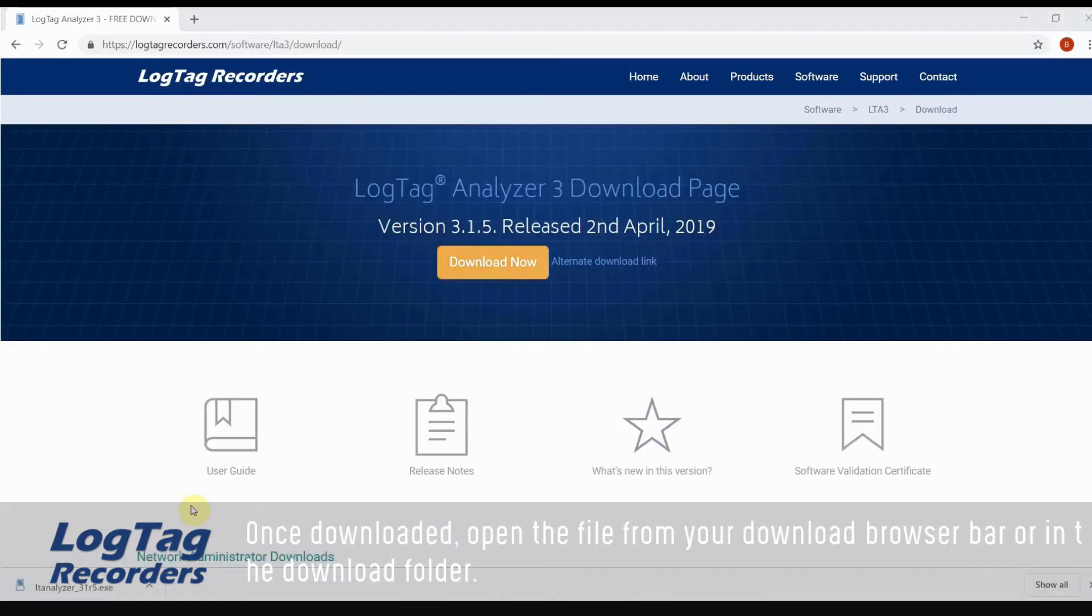Once downloaded, open the file from your download browser bar or in the download folder.